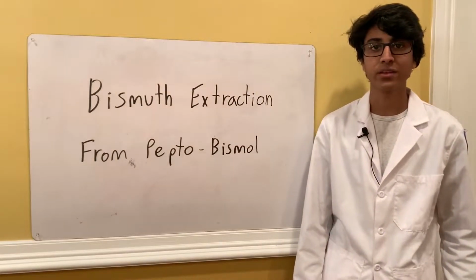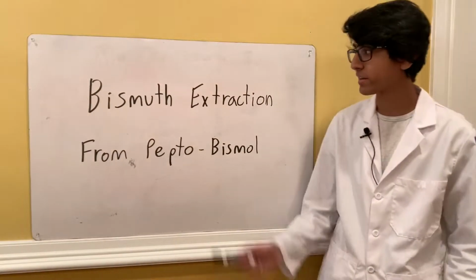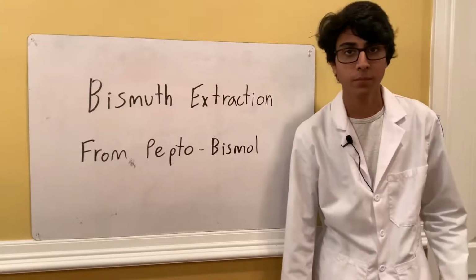What's up guys, welcome back to Ubad's lab, and today we're going to be extracting bismuth from Pepto-Bismol.